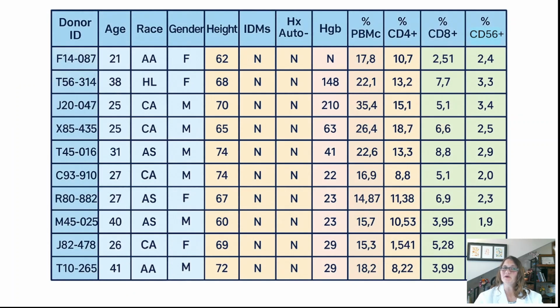Another application of flow-based donor screening is to establish a donor database. While an individual's immune cell profile can help determine whether they are a fit for a specific collection, having this data available on many donors can help collection centers be more proactive in identifying and recruiting the right donors for screening. A well-annotated donor database can be searched to find the donors that fit developers' requests and match donors to specific therapeutic programs. For example, donors with high NK cells can be reserved and recruited for developers creating NK cell-based therapies.